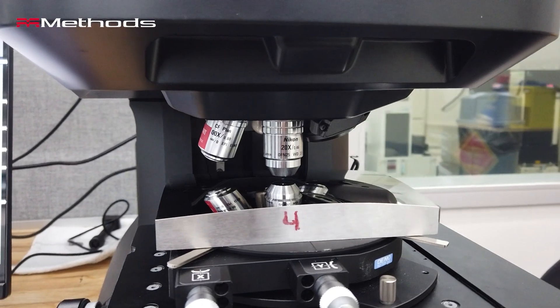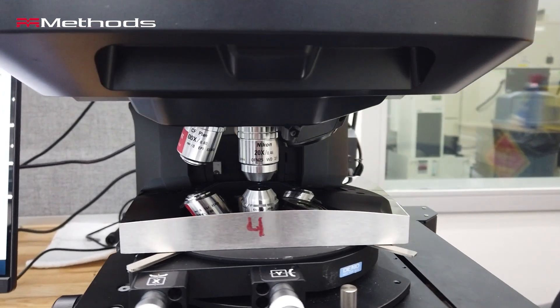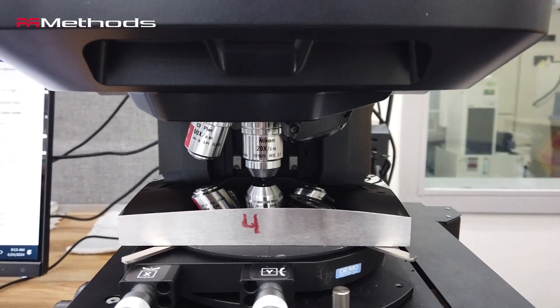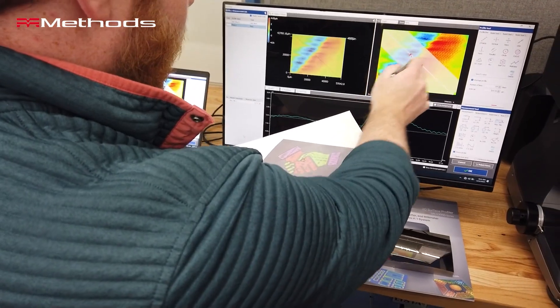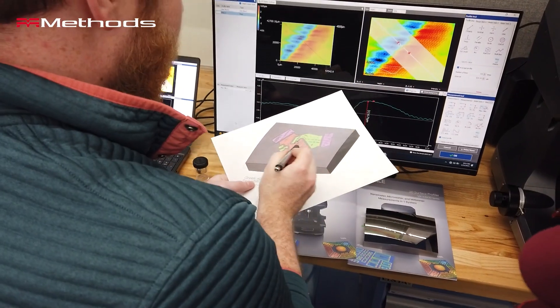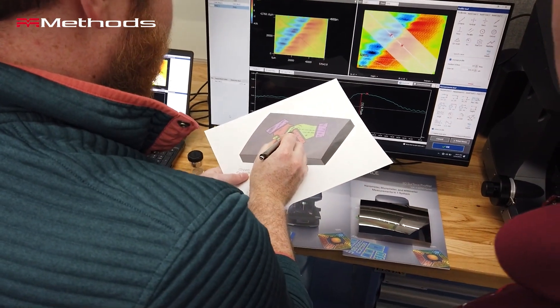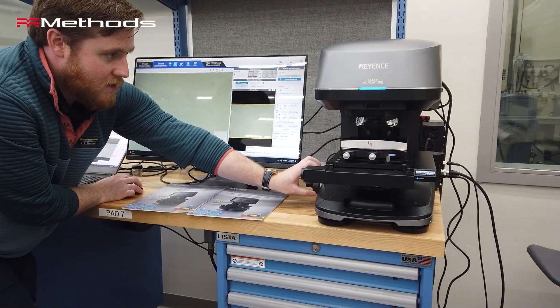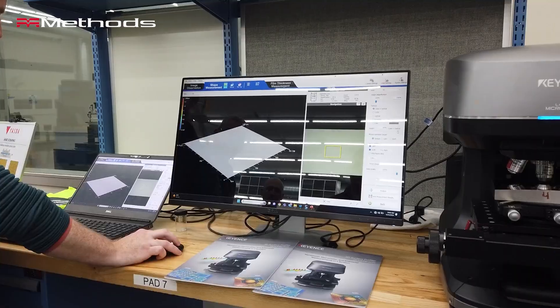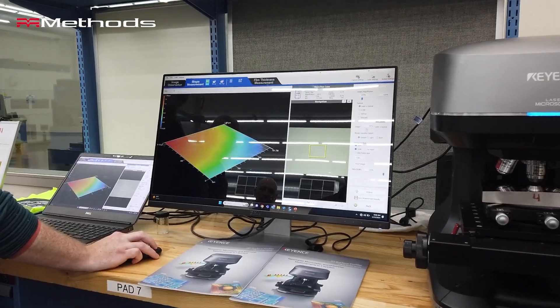That's where Keyence came in with an optical profilometer. An optical profilometer uses lasers to measure surface profile. Those lasers are going to find their way into every groove of the part, and they're not going to scratch the part.